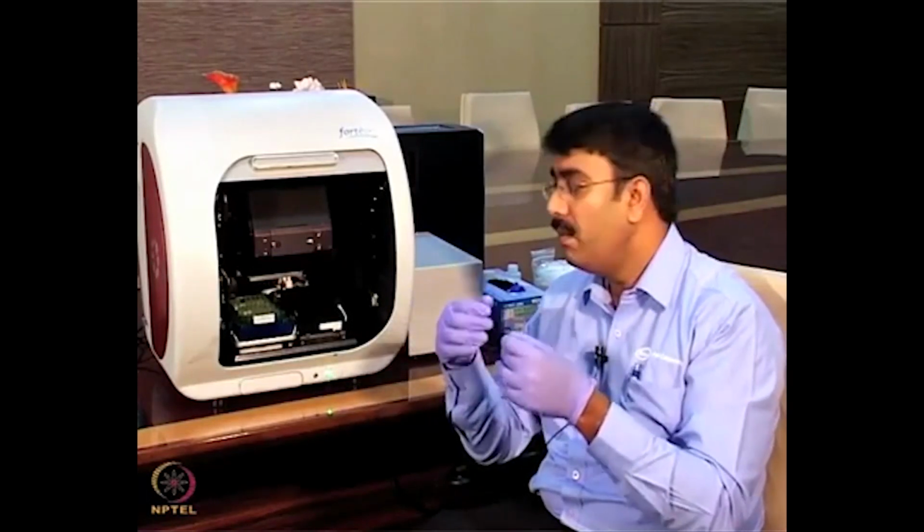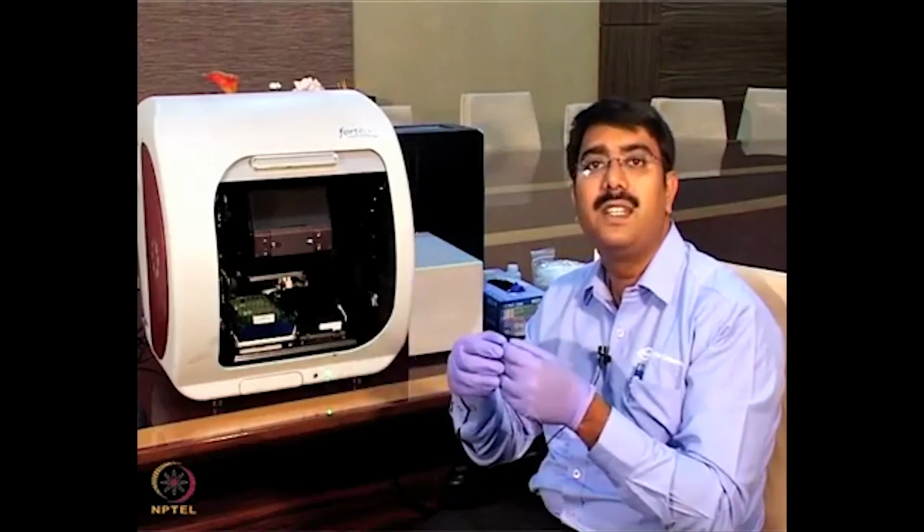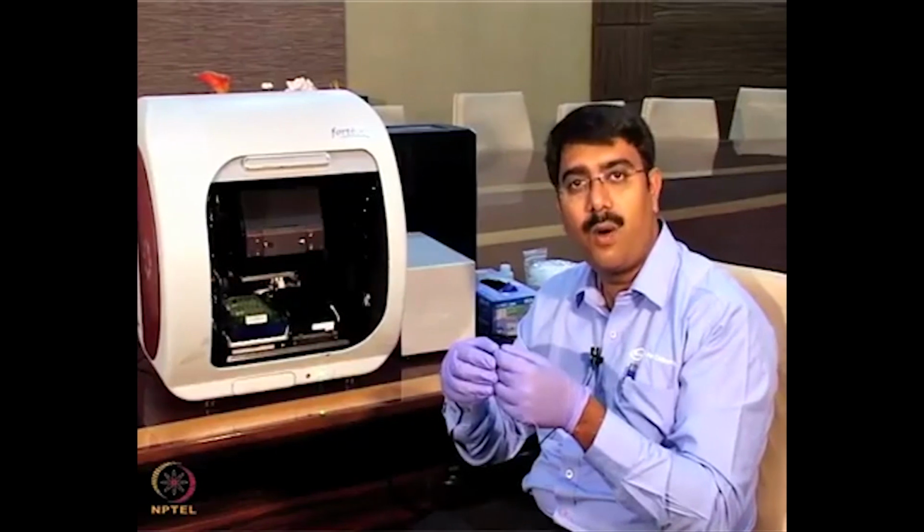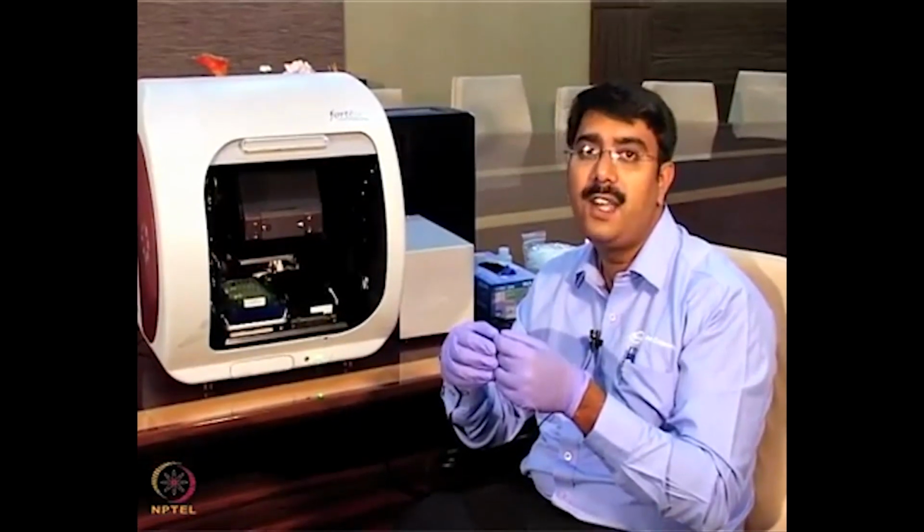Apart from that, the major use of this instrument is to study binding kinetics, where we determine the rate constants like on rate and off rate, as well as the affinity constants. I am going to demonstrate the kinetics interaction of the mouse monoclonal antibody to the protein A ligand.